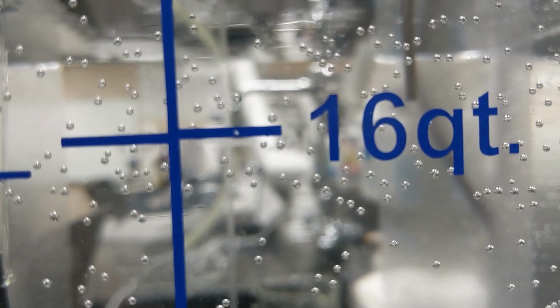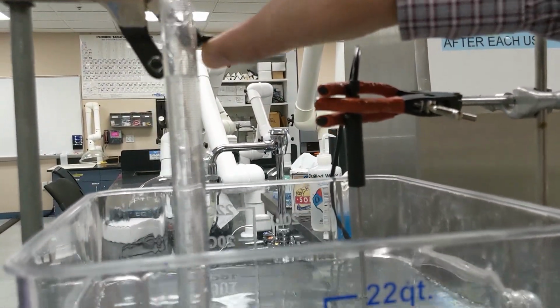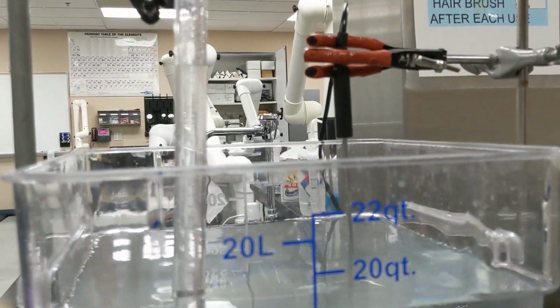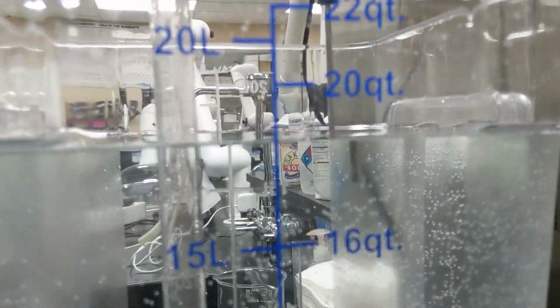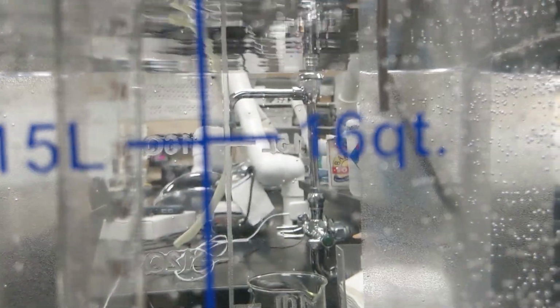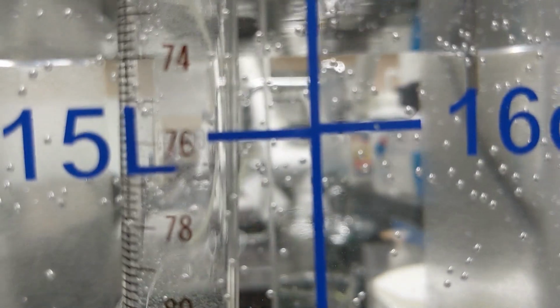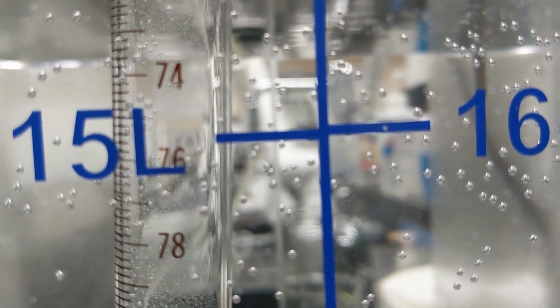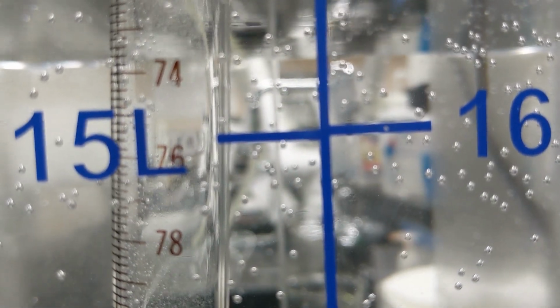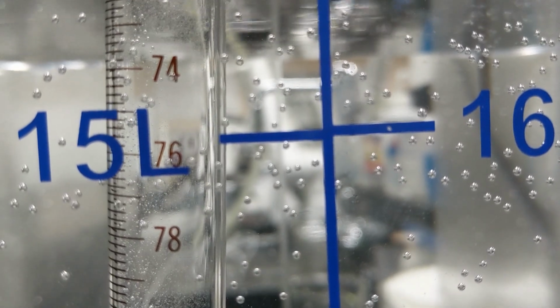So what I'm going to do is adjust the water level so that the water level in my eudiometer tube is at the same level as the level in this reservoir. And then we can read the volume of the gas that's contained in there. The reason I'm doing this is to make sure that the pressure in the room, the atmospheric pressure, is the same as the pressure in the eudiometer tube.